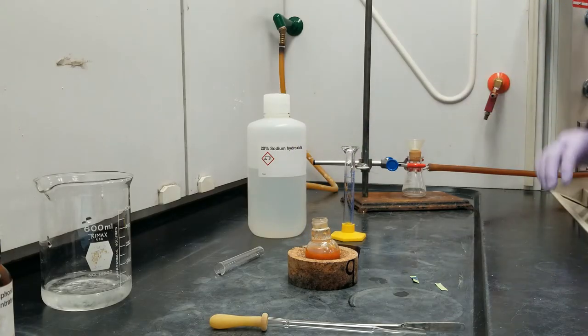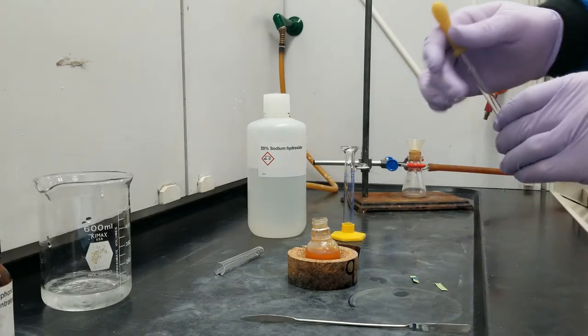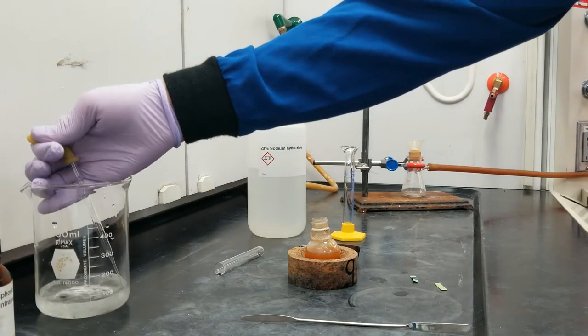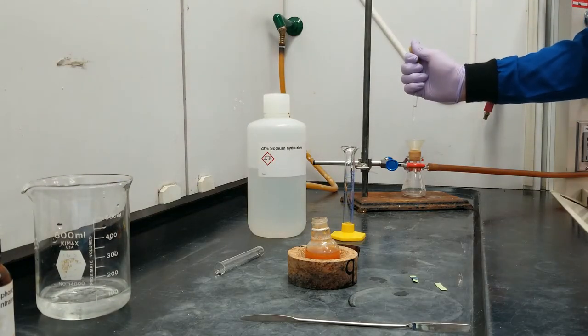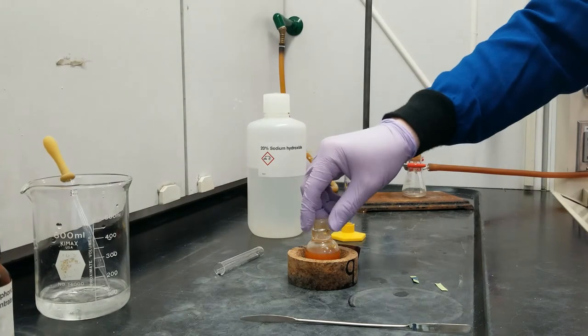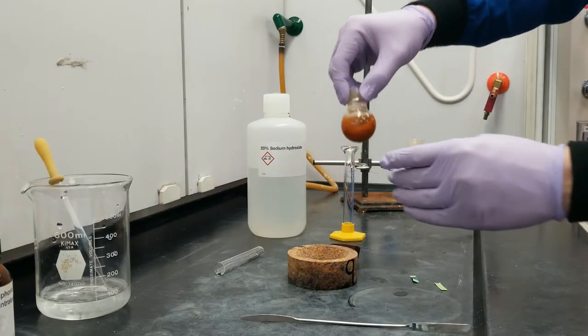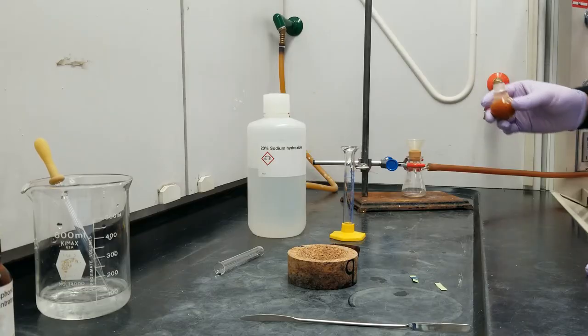So let's get our vacuum filter ready. I'm going to turn on the vacuum. And just to get that filter paper sucked down, I'm going to use a little bit of ice water. I'm going to give this a good swirl to try to agitate the stuff in here, get it kicked up into solution, and then I'm going to go ahead and filter.